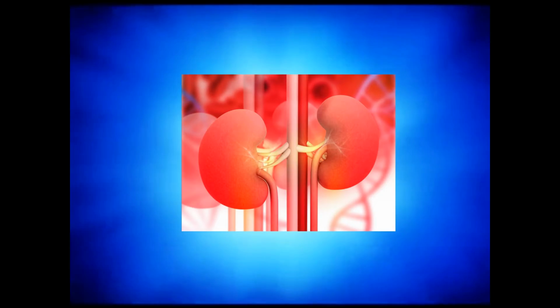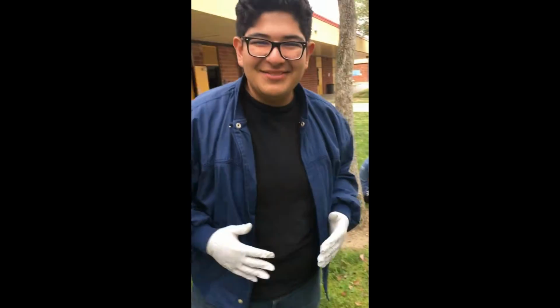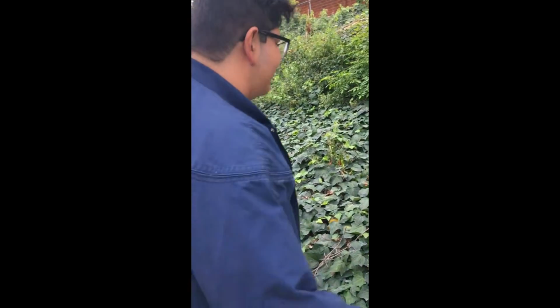Preparing the kidney dissection. Alright, are you recording? Yeah. Alright. Hi, my name is Hector Azon, and I'm Nathan Santos, and we're on the kidney expedition. We're gonna come over here. We're gonna look for some nice juicy kidneys.